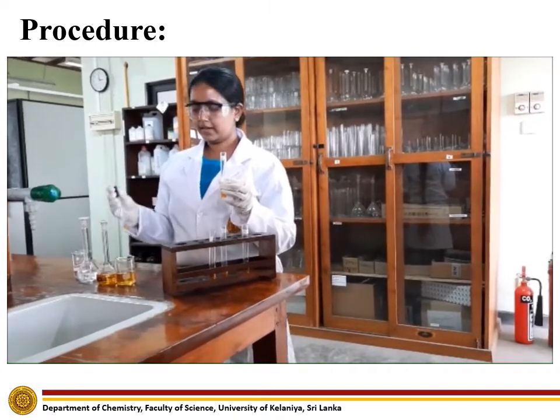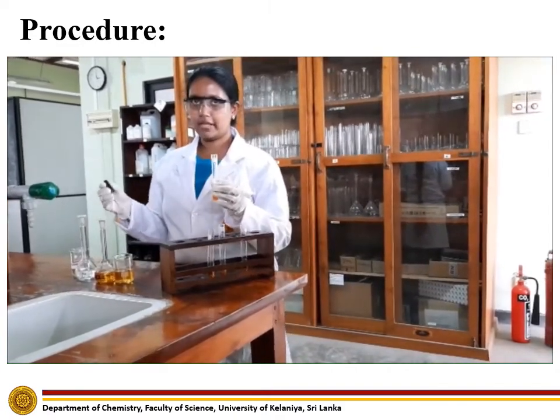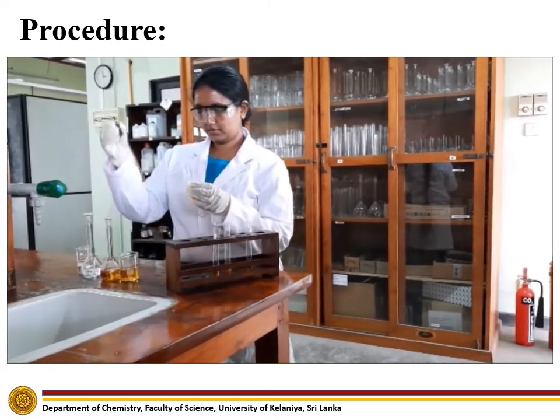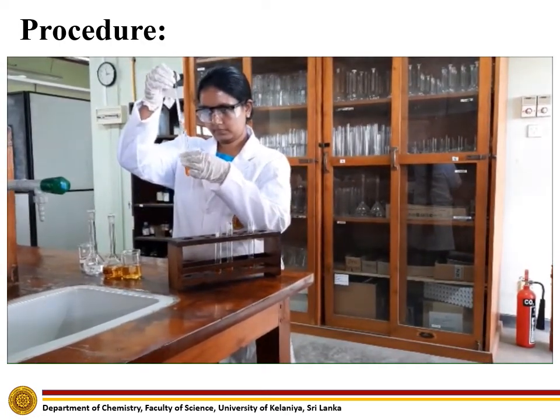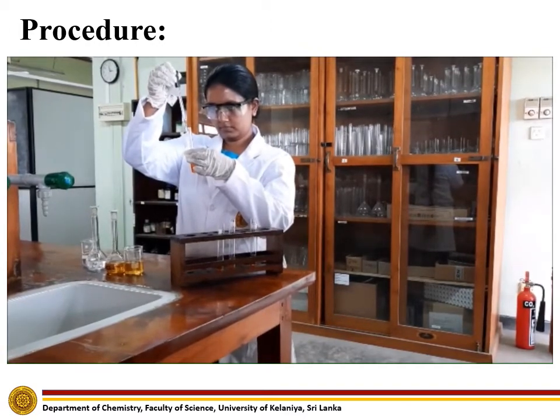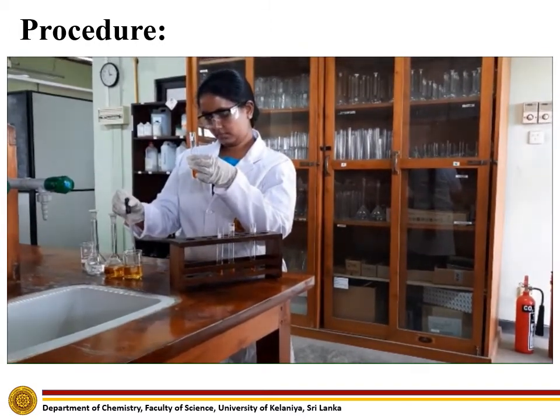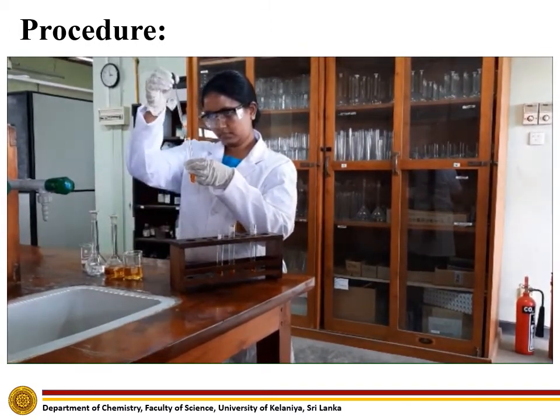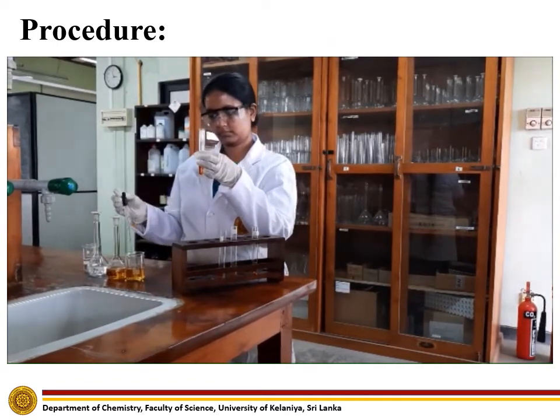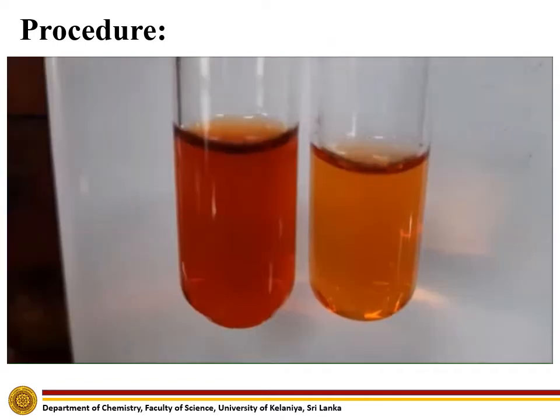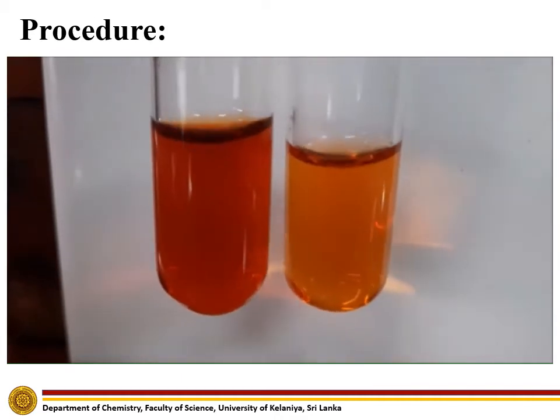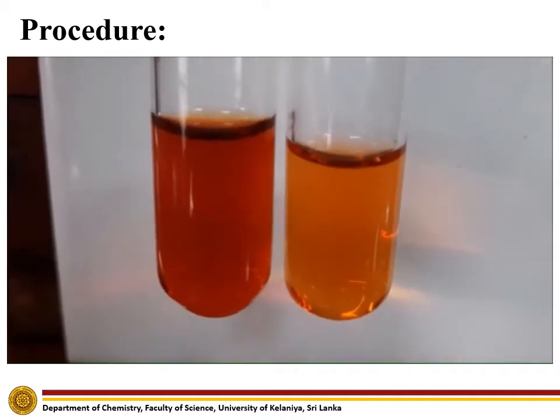To the third test tube, add 10 drops of ferric nitrate solution. Compared to the control, the third test tube turned into a blood red solution.